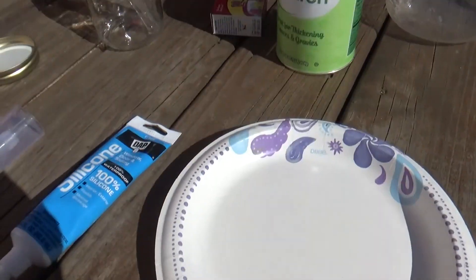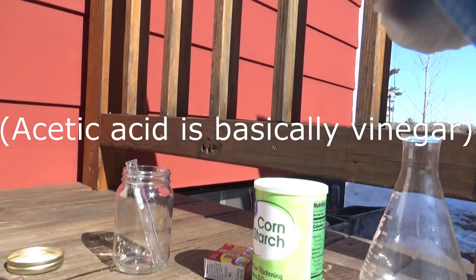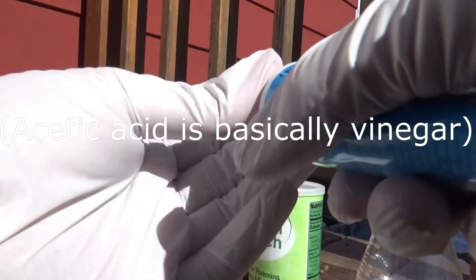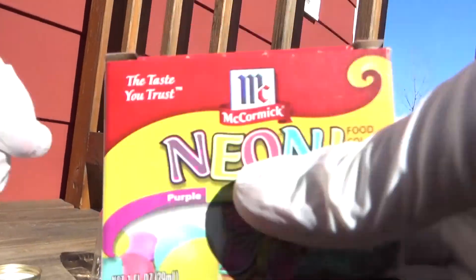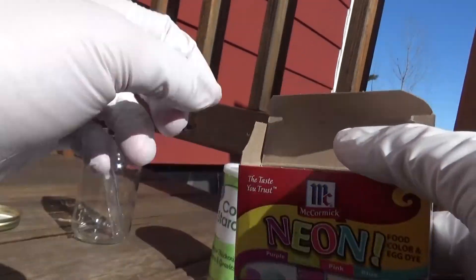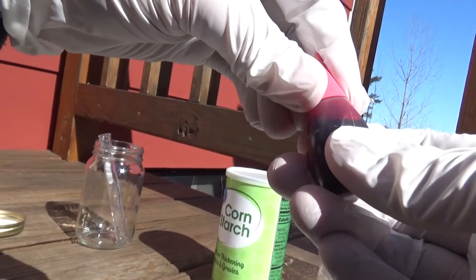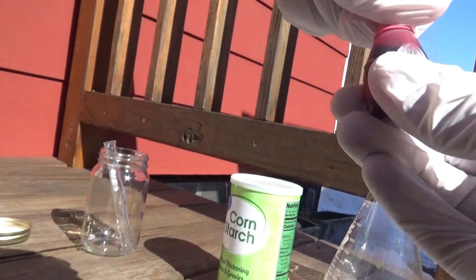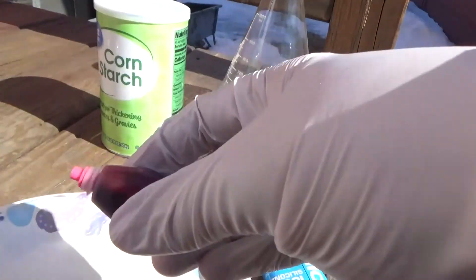The first thing we're going to do is take our silicone — make sure it's 100% silicone and that it uses acetic acid to cure. Before we open it, we're going to take our food coloring, open that up, and pour it into our plate. This color kind of resembles rubber stoppers.